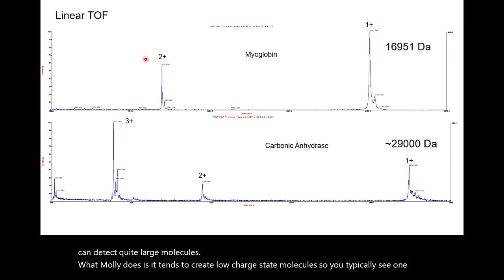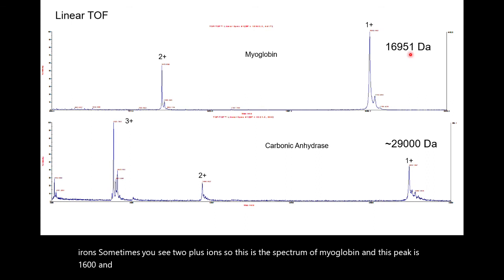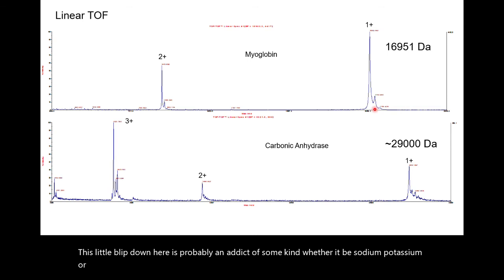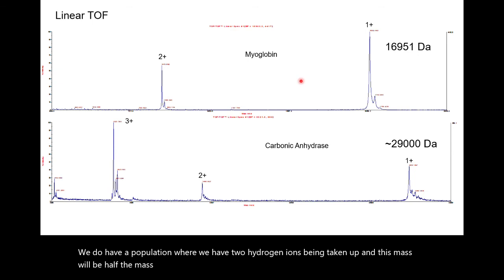So this is the spectrum of myoglobin, and this peak is 16,951 Daltons, which is the intact mass of the protein plus a hydrogen ion. So you can see that here. This little blip down here is probably an adduct of some kind, whether it be sodium, potassium, or something such as that, or it could be a post-translational modification. We do have a population where we have two hydrogen ions being taken up, and this mass will be half the mass of this, for reasons that we discussed in the last lecture.